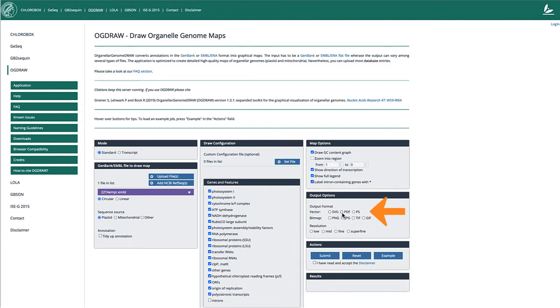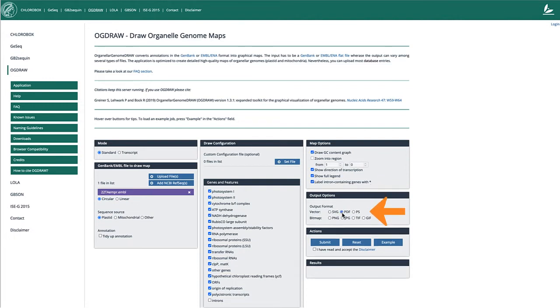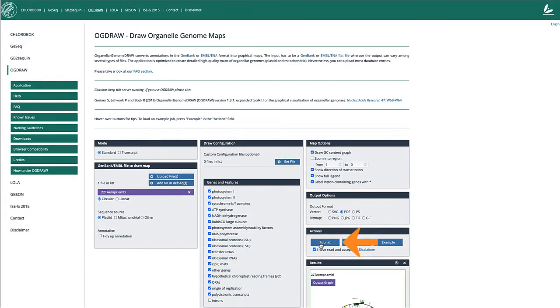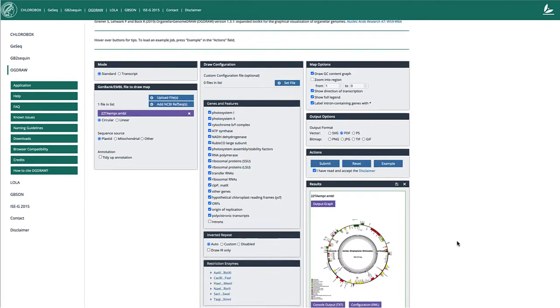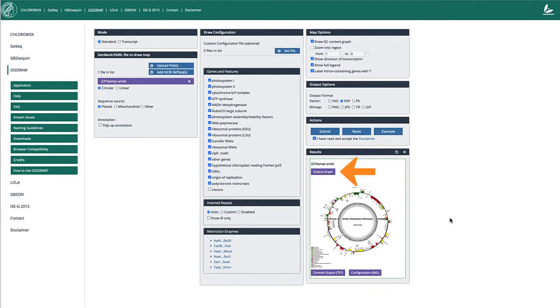I select PDF in the Output section and submit after accepting the terms and conditions. The figure appears in the results section and can be downloaded.